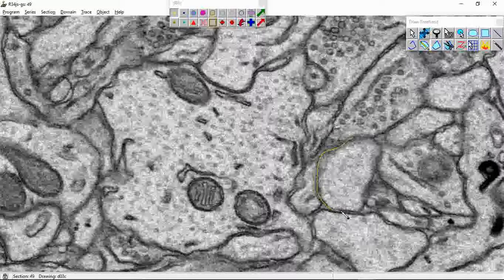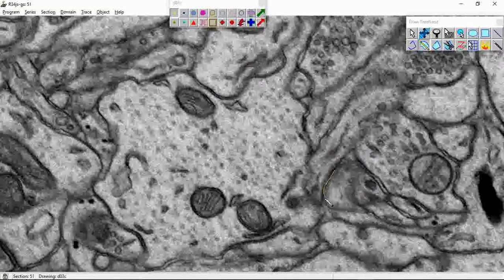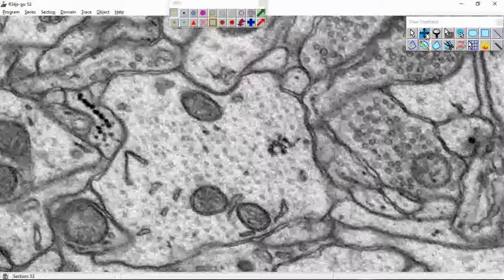And as you can see, the dendritic protrusion is getting smaller, but it is still there. And if you miss a couple sections like this, once again, your protrusion will appear somewhat flat, and that is not desirable. We want to correctly model how the dendritic segment actually appears in the neuropil. And at this point, the protrusion is pretty much gone. I may just add in a little trace right here just for the 3D modeling, and I'll make sure it's within it.